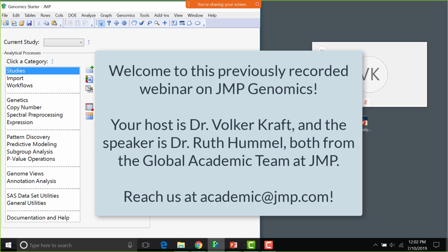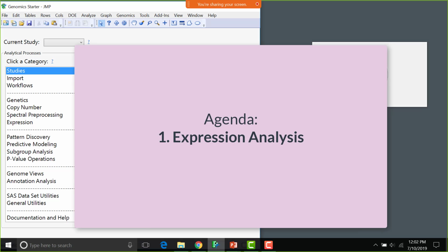So as Volker mentioned, I'll talk in some sections. First we're going to talk about an expression analysis, how to do that in JMP Genomics, kind of what your goal is, and then we'll take a little break and you can ask questions related to that topic.